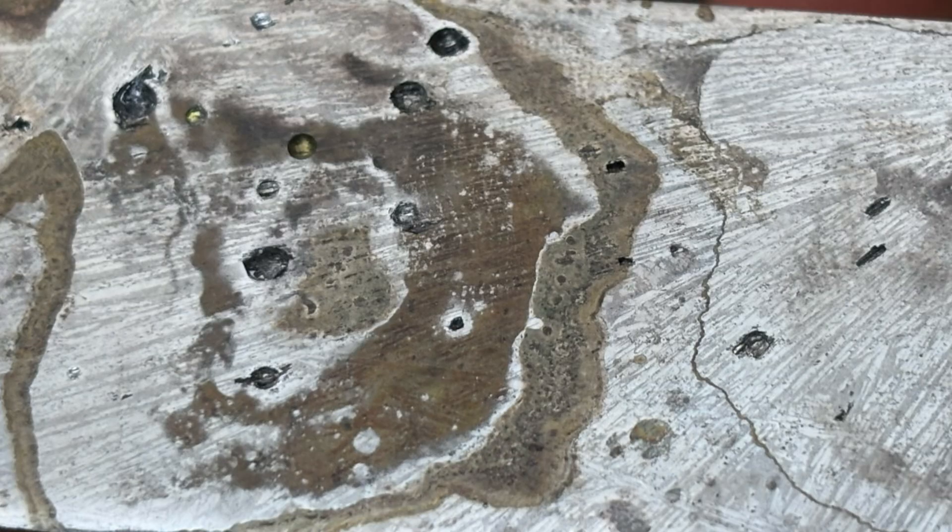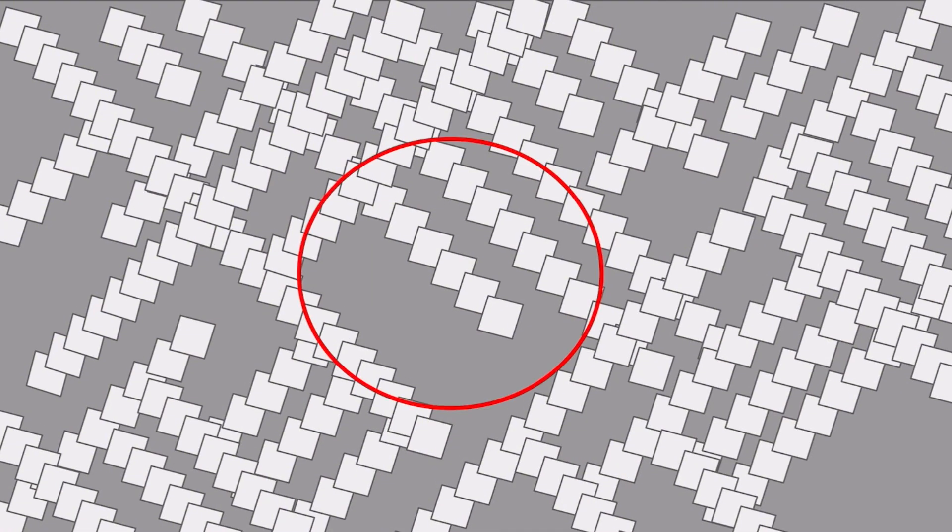Now, I don't claim to be an expert on etchants at all, but I would confidently say that this material is pretty difficult to etch to achieve the contrast that we're looking for. Here's the Widmanstätten-like pattern that we achieved — the intermetallic rods are actually made up of individual repeating crystals, and the darker region in between is that eutectic material. Zooming in even more, we can really resolve that eutectic region. We have two phases: the alpha aluminum in gray and the theta aluminum in white. The theta aluminum is otherwise known as the aluminum-copper intermetallic compound, and it's present in both the eutectic region as well as in those square crystals. In my opinion, its presence in both of these regions is one of the main reasons why this etch is so difficult.